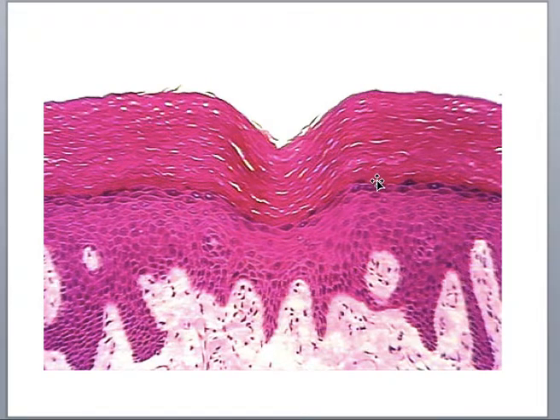This up here where you don't see any nuclei, so these darker spaces, you can see the nuclei in the cells of these layers, but up here you can't see nuclei. So it's because these are all dead cells. So this is an example of stratified squamous epithelium where it's keratinized. We'll talk about the process of keratinization in the integumentary system.